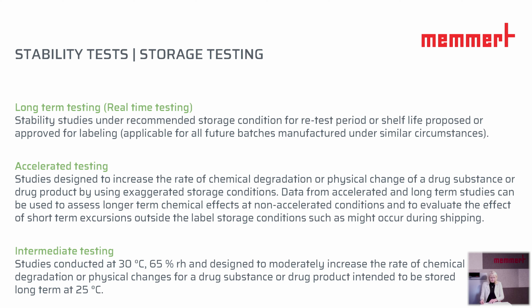Long-term testing, that is stability studies under recommended storage condition for the retest period or shelf life, proposed or approved for labeling. That is the real-time testing. Or the accelerated testing, studies designed to increase the rate of chemical degradation or physical change of a drug substance or a drug product by using exaggerated storage condition. It is necessary to do long-term testing and accelerated testing.